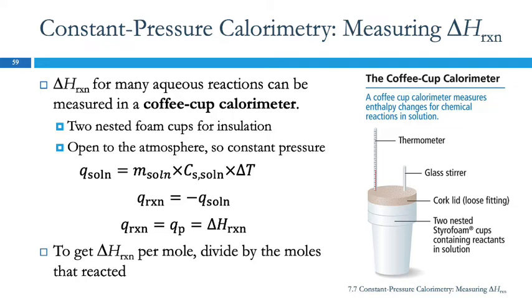We talked about a bomb calorimeter. This is something much less fancy, a coffee cup calorimeter. And it literally is made out of styrofoam coffee cups. And when we do experiment 7B, we're going to use coffee cups and do something like this.